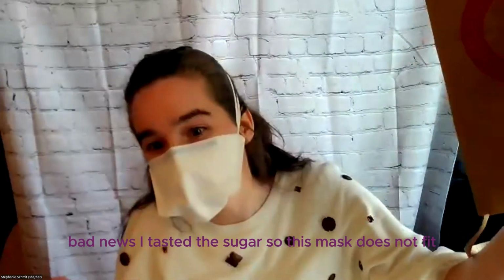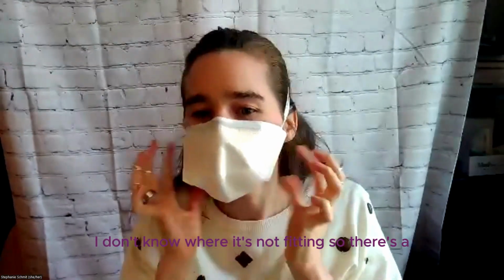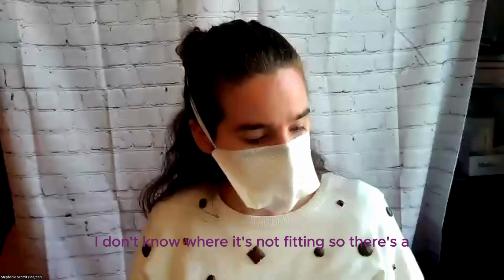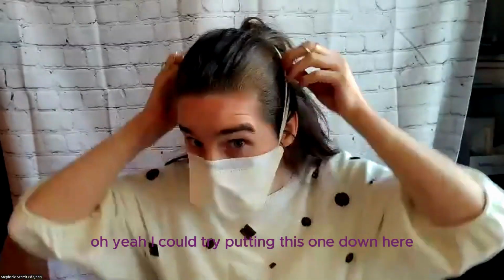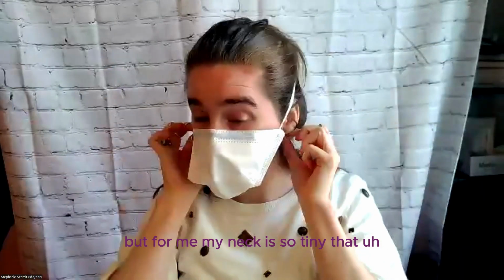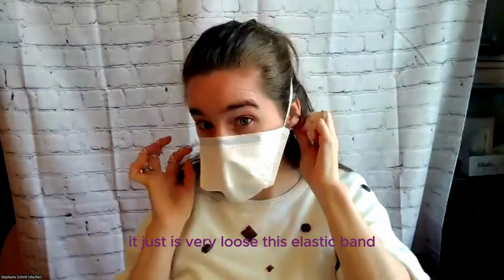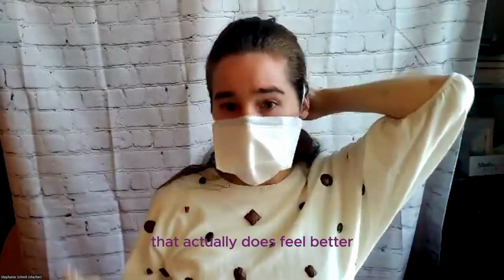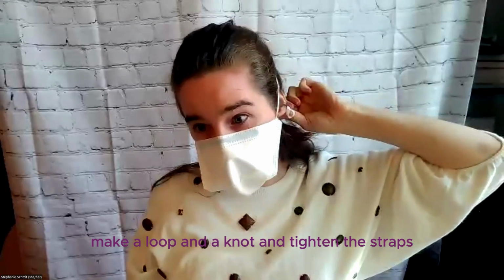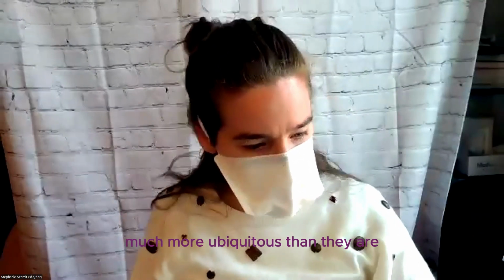Bad news, I tasted the sugar. So this mask does not fit. I don't know where it's not fitting. I could try putting this one down here, but for me, my neck is so tiny that this elastic band is very loose. So it's possible that maybe I could tighten it and it could fit. Oh, that actually does feel better. So I could make a loop and a knot and tighten the straps. This is why I think that mask sample packs should be much more ubiquitous than they are.